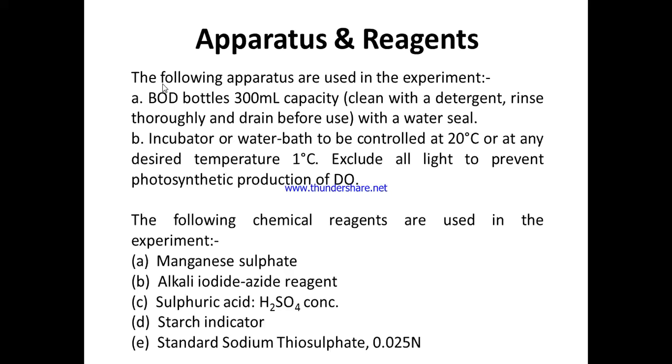300 milliliter is its capacity. We clean it properly with detergent, rinse thoroughly and drain before use with water seal. Okay. So basically, we need a 300 ml BOD bottle.